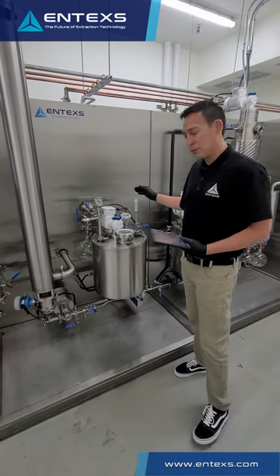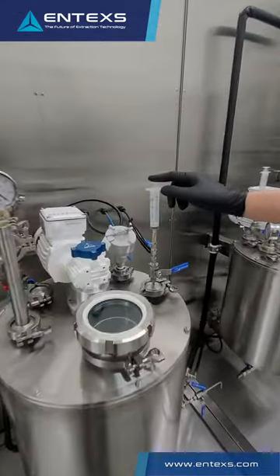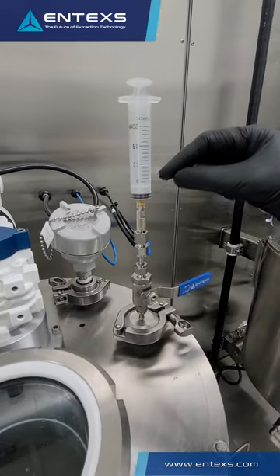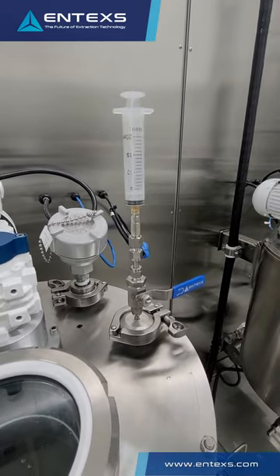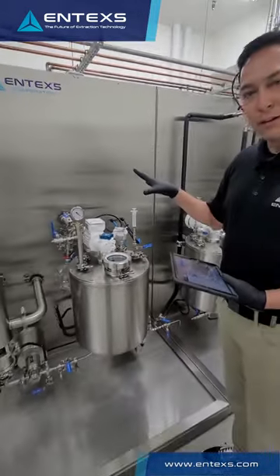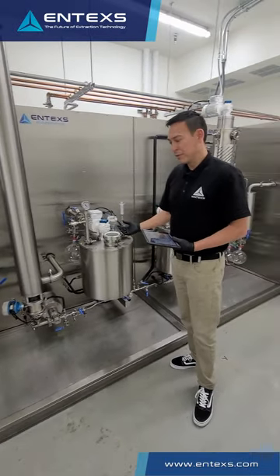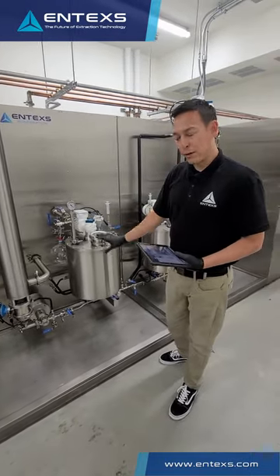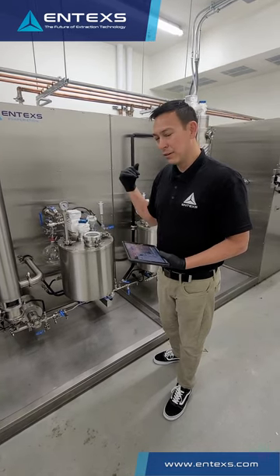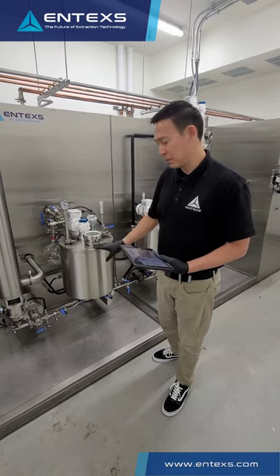Another feature that is very useful in this piece of equipment is a sampling port. While the process is running, you can take samples of your product and use HPLC analysis or send out to labs for analysis without ever breaking vacuum or introducing oxygen to your product. So you're left with a full spectrum crude oil on the output of this equipment with no open exposure from extraction. It's all closed to this point.